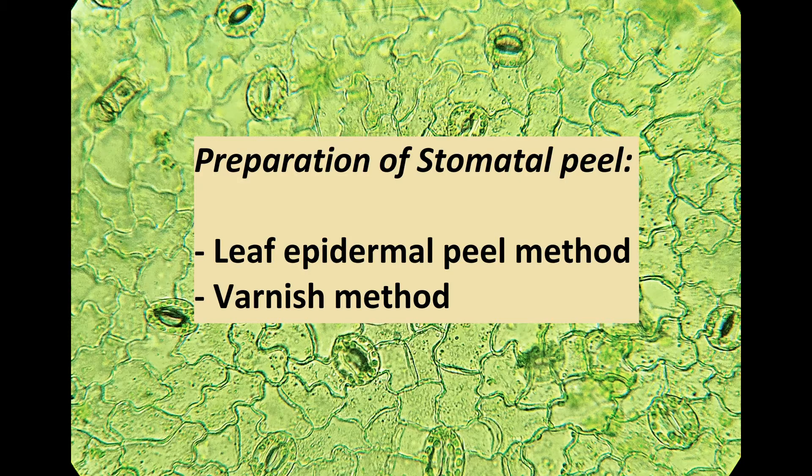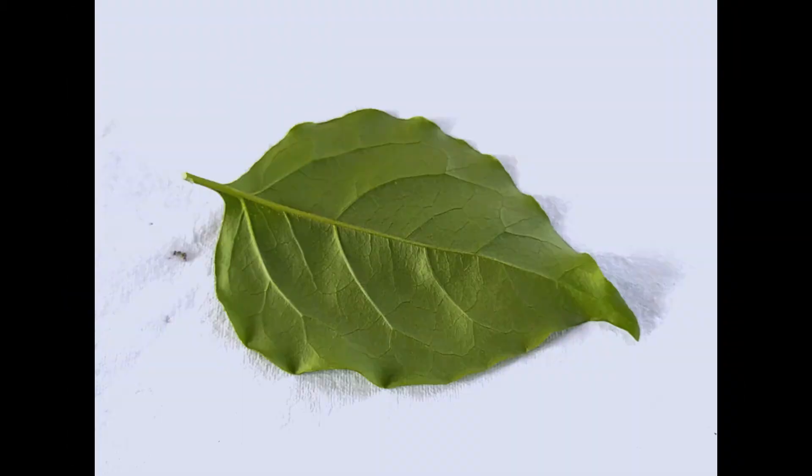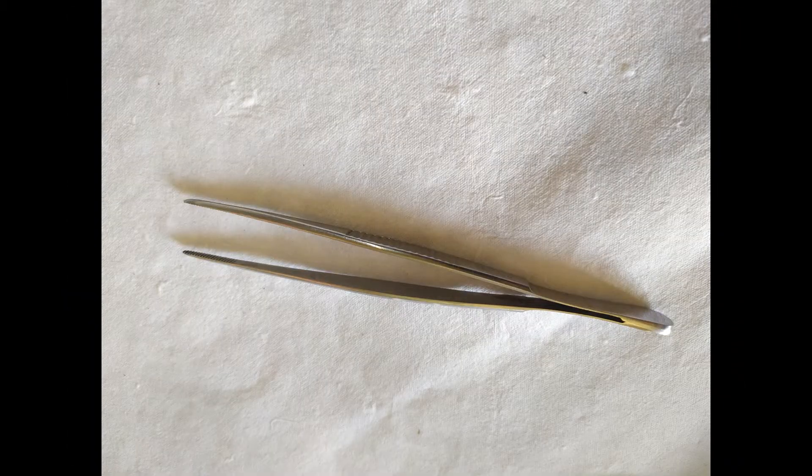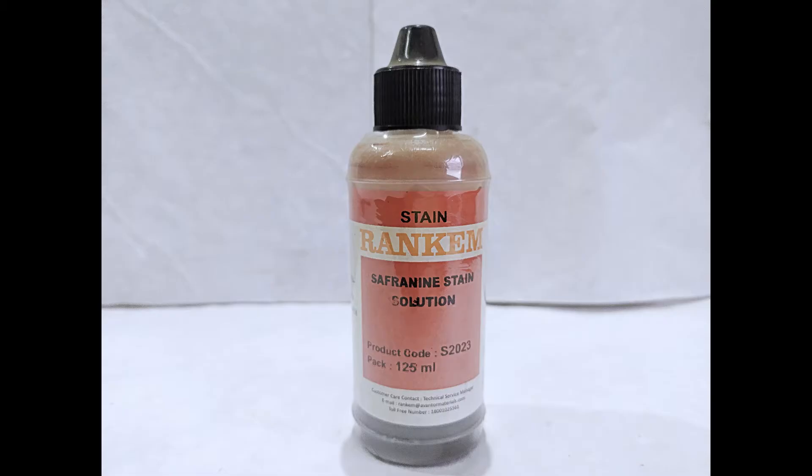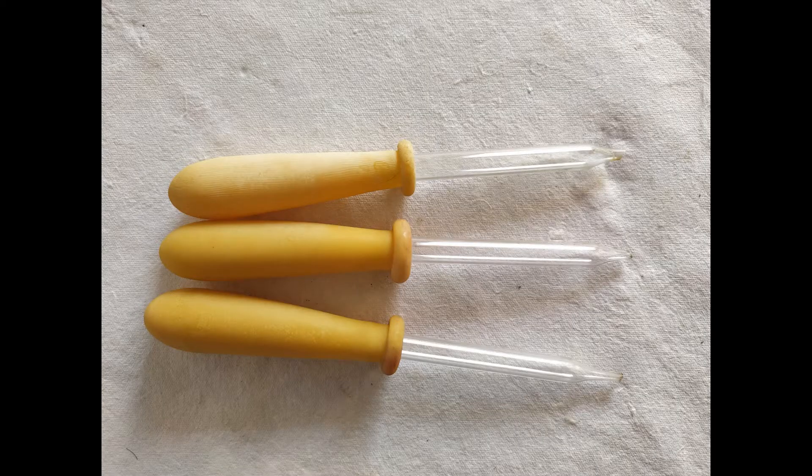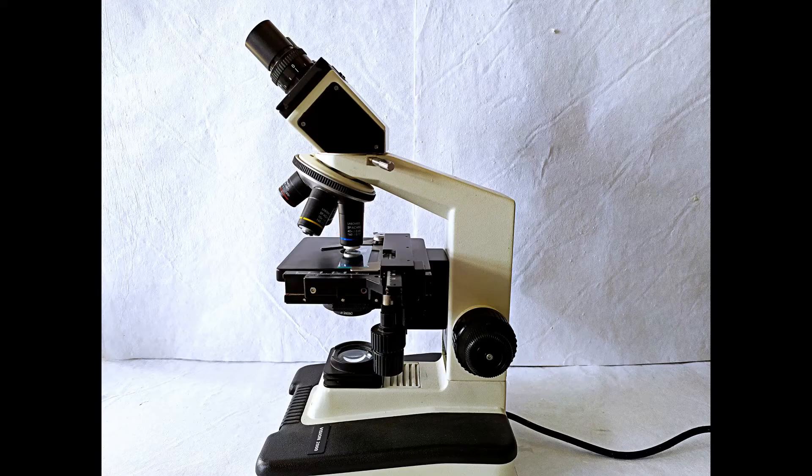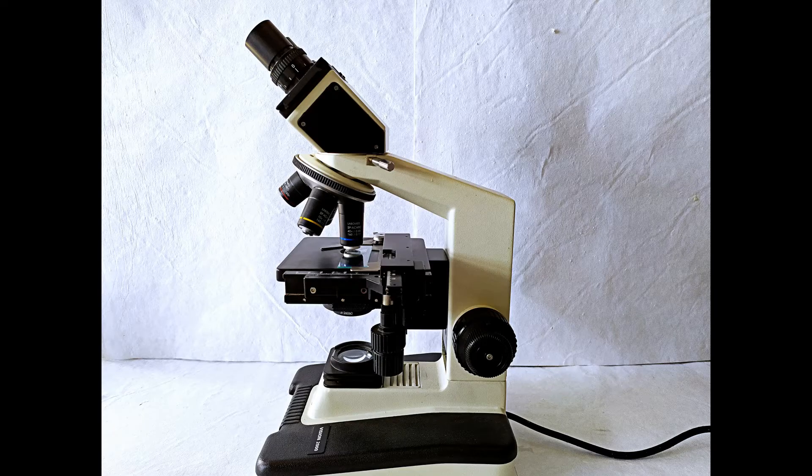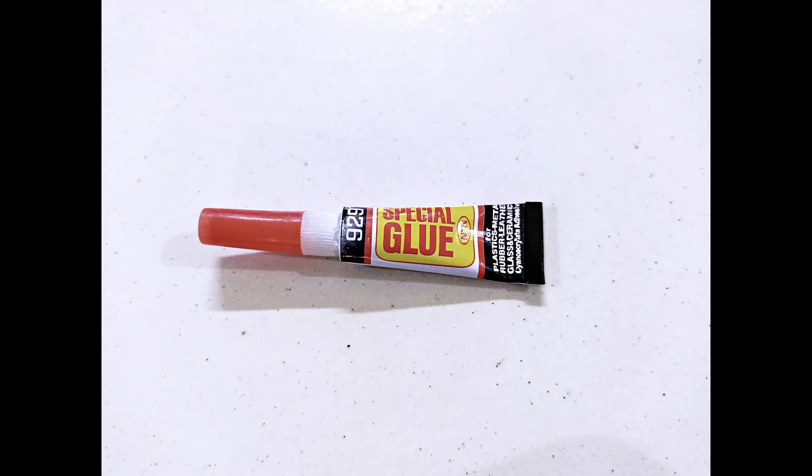For this experiment, we'll need the following: fresh green leaves, tweezers, a staining solution such as safranin or light green, droppers, glass slides and coverslips, a compound light microscope, and a quick drying glue such as superglue or a transparent nail polish.